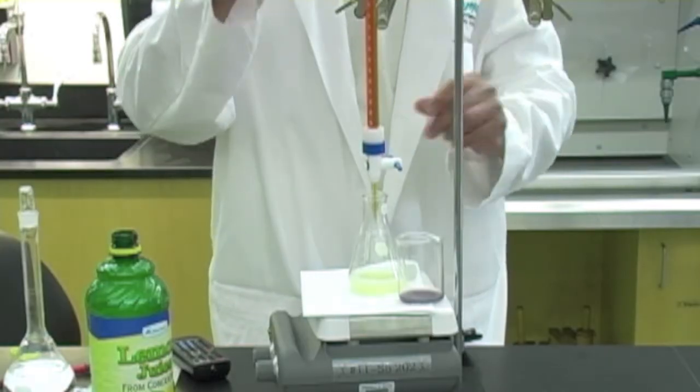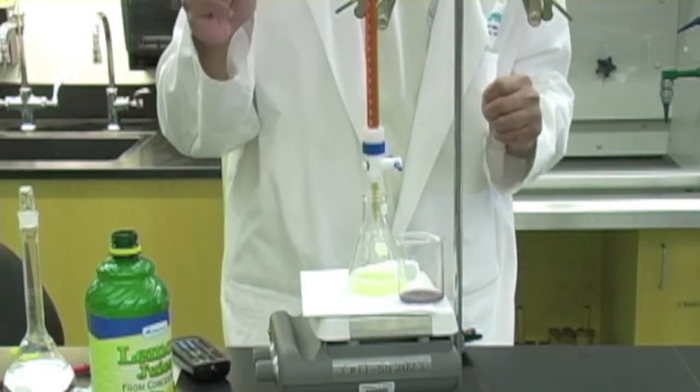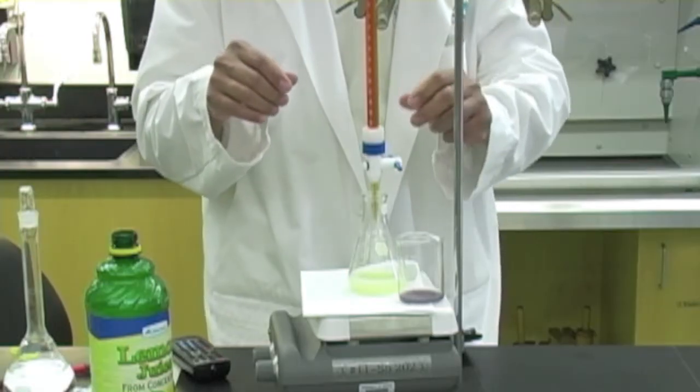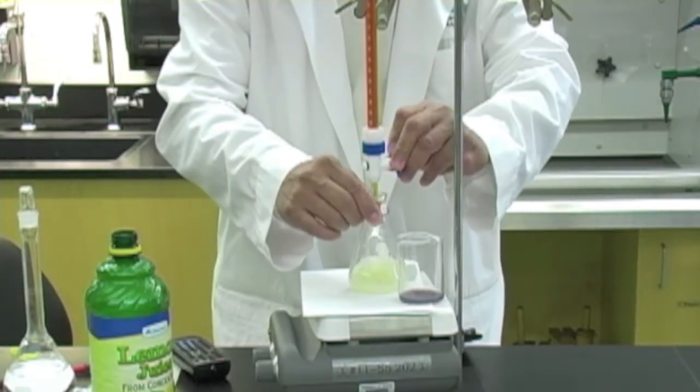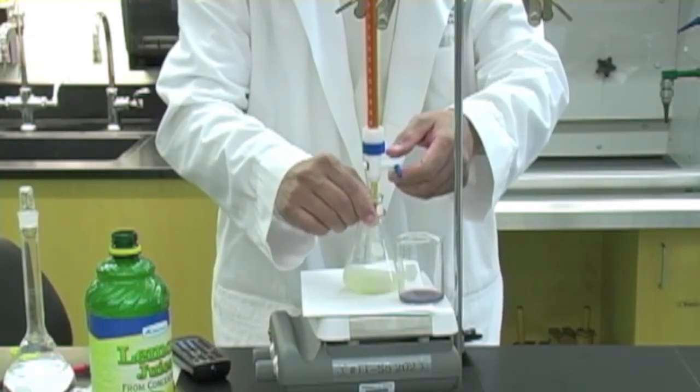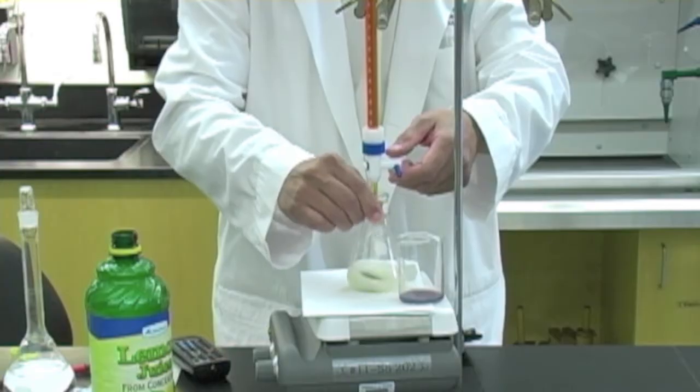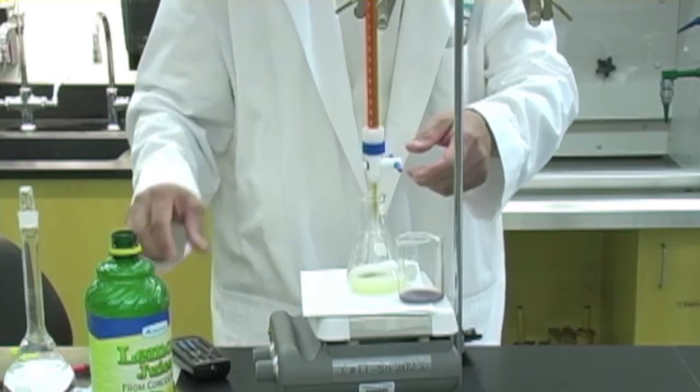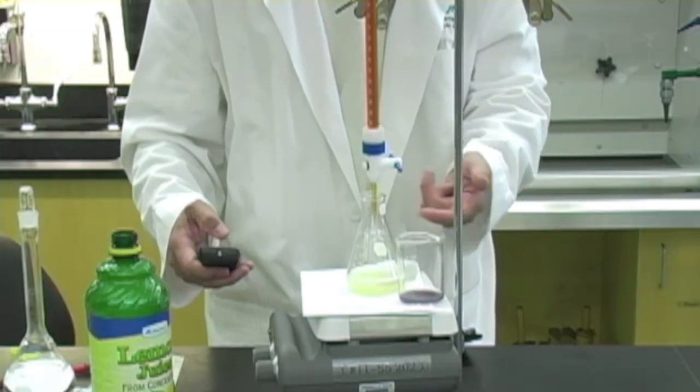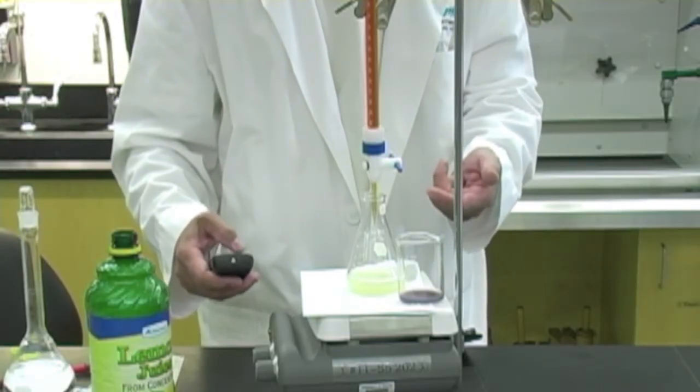So what I'll do is I will read the initial volume of the burette and then I will begin my titration. And initially I want to go ahead and add my iodine. As I approach the endpoint what should happen is that that murky dark color should persist longer.